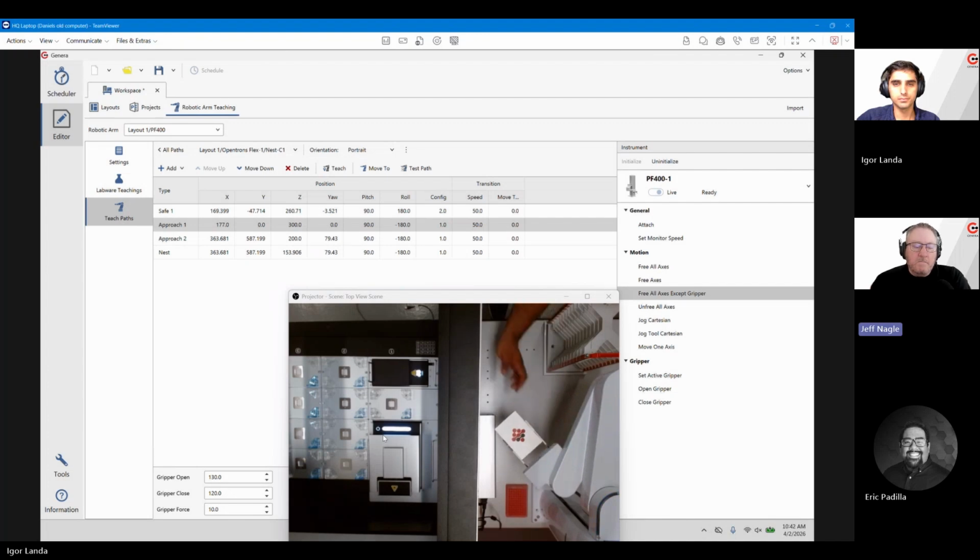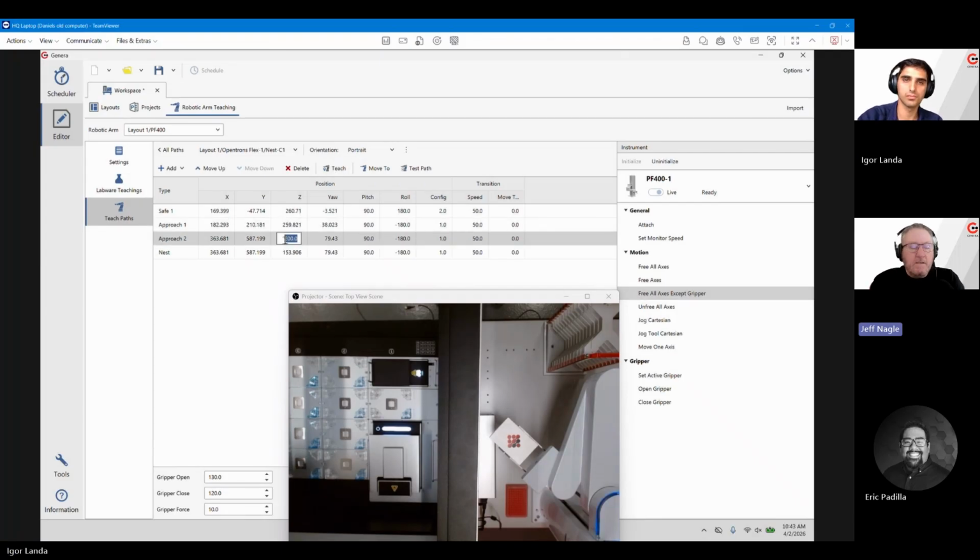Yeah, this is the same sort of scenario that we would have seen in the hotel, which we did, where it hit the side of the hotel to get in there. There are things around that nest position, that teach point, that you have to get around, and you can't necessarily come in from the sides or low in this case. So you do have to come out a little bit and make a way in, straight in or out. Depends. So that's why you could add as many approaches as you want or as you need for your teach position. Exactly.